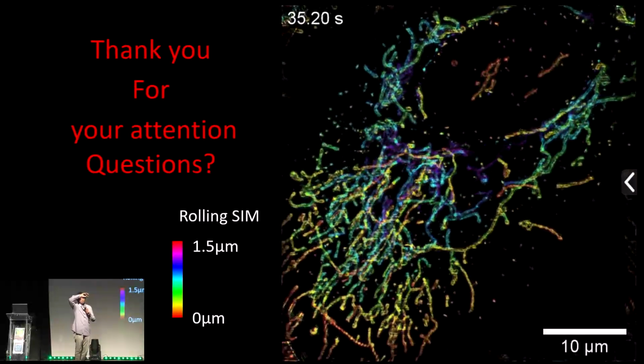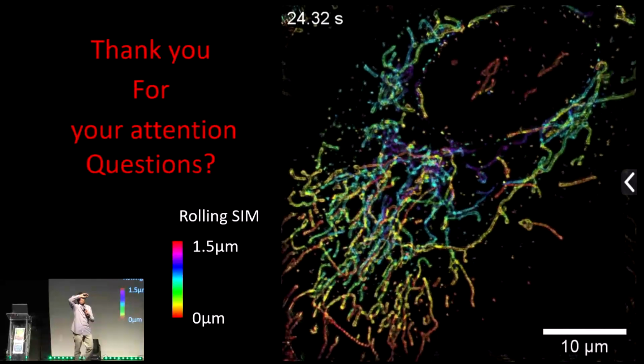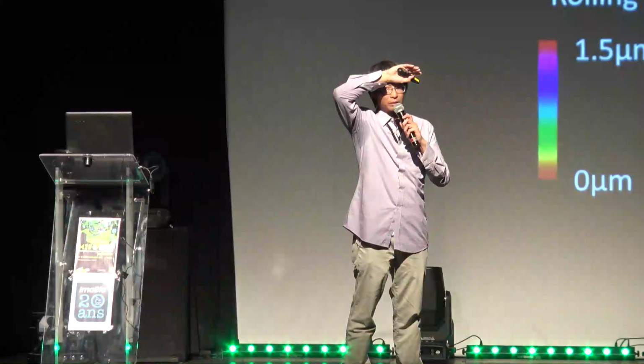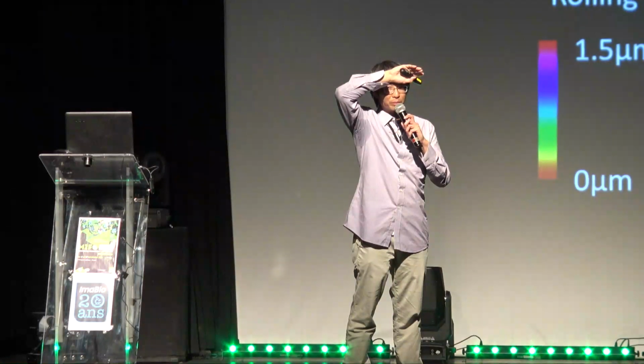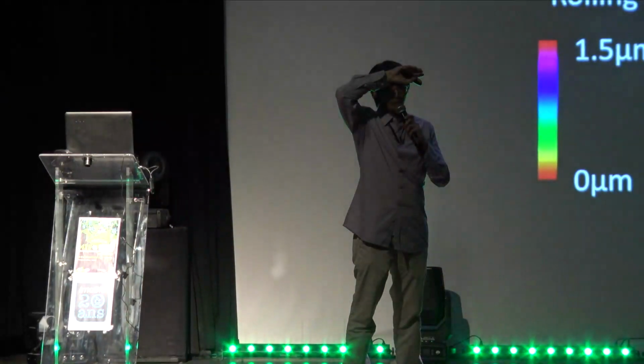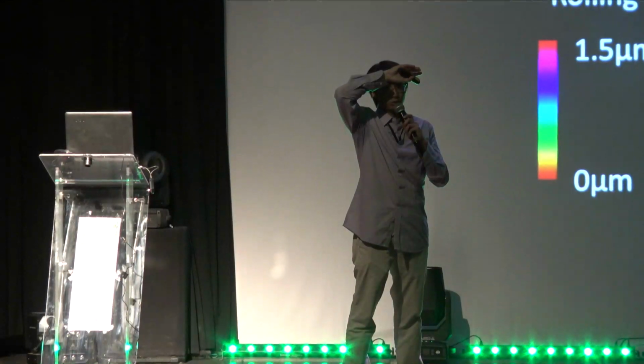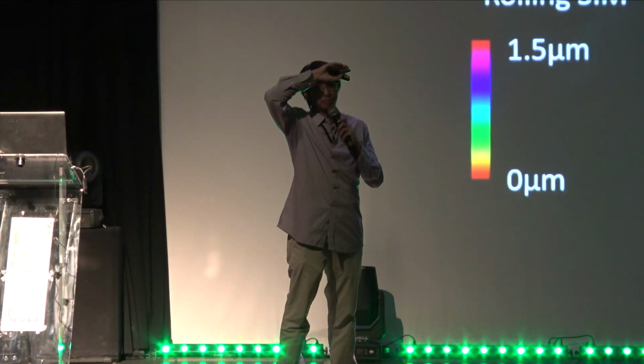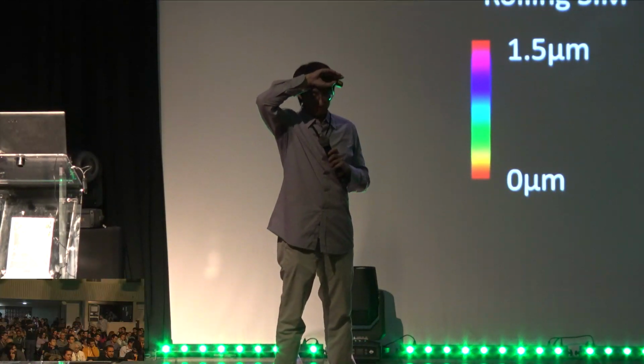Is this something you practically determine, or do you actually calculate certain degrees that you need? I don't remember exactly now, but you need to compromise between different parameters. So I think in the end, most of the time we use 45 degrees. Okay, and then maybe one more question.